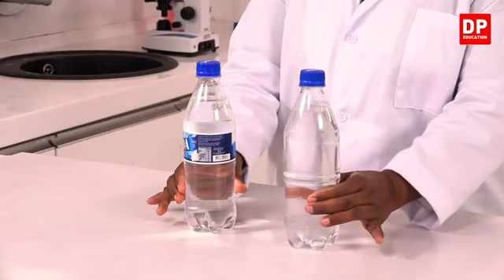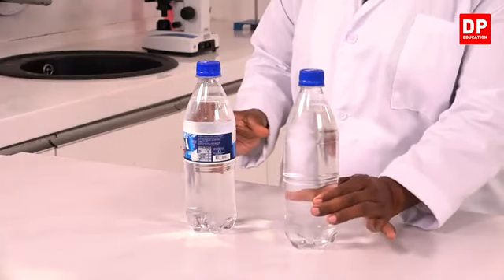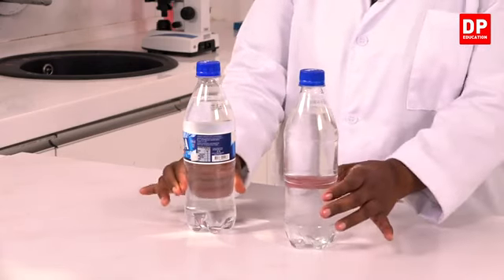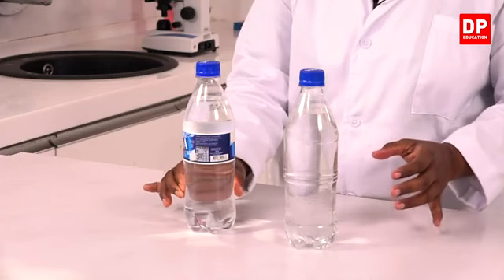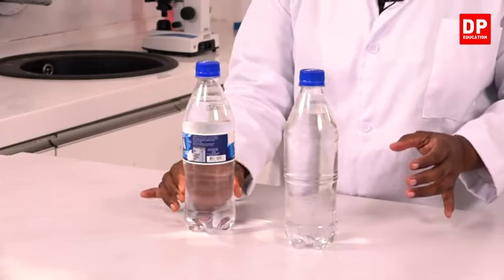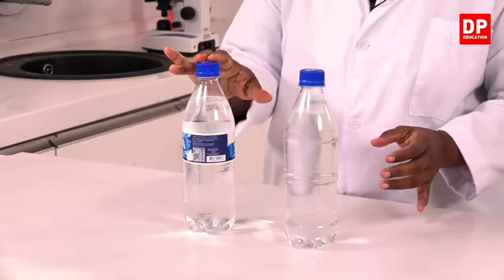I will try to press the two bottles from the bottom. If I press, you can see the bottle that contains water gets compressed a little bit. But I apply the same amount of force, but I am unable to compress the bottle that contains aerated water.